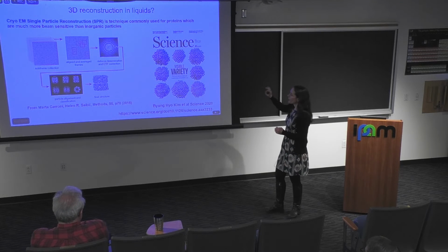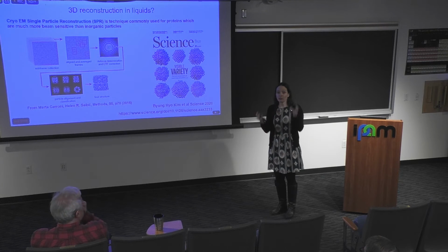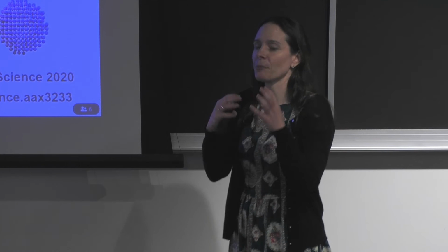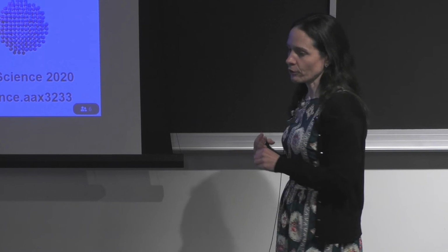But now they have done some very clever analysis of those platinum atoms and use the fact that because they're in the liquid, the platinum can rotate, it can roll. And you therefore have a lot of different measurements of that platinum atom at atomic resolution for different orientations. And you can then process all those different orientations to create a tomographic reconstruction.